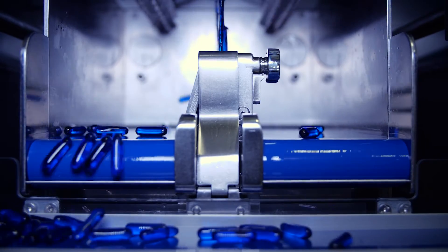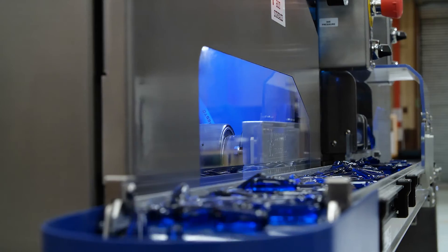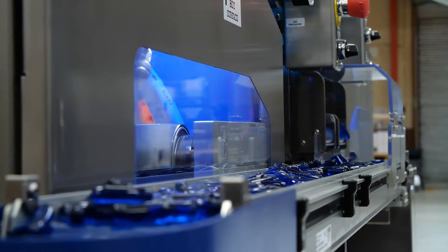Capsules can be produced in a variety of shapes and sizes, and can even be customized according to customer requirements.